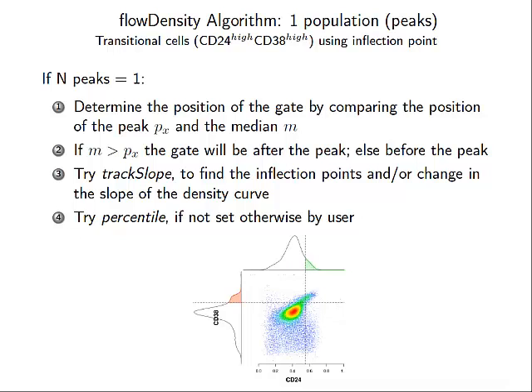If it's one rare population in 60,000, unless you have some kind of hypothesis that that's the one. And if you have a hypothesis that it could be something in here, then you can do a diagnostic kind of approach as well as a discovery approach, and there's nothing wrong with that. You could say, well, I have this hypothesis in my head that it's sort of T or B cell related, and you know most of the common immunophenotypes, and you can do that on your discovery data set to find those common things, and then on top of that, run something completely unsupervised. That works. We haven't done that yet, but that's a completely viable kind of approach.